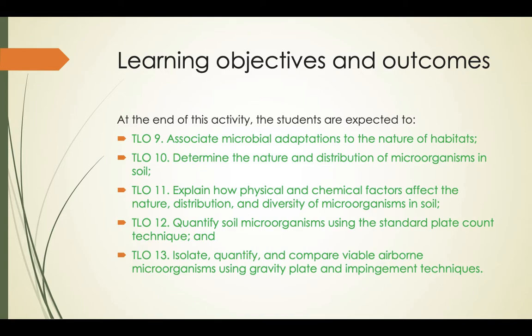And lastly, you must be able to isolate, quantify, and compare viable airborne microorganisms using the gravity plate or the settle plate and impingement techniques for the case of microbial sampling from air. So if you will notice, the first three are actually outcomes, while the last two are more of the objectives.